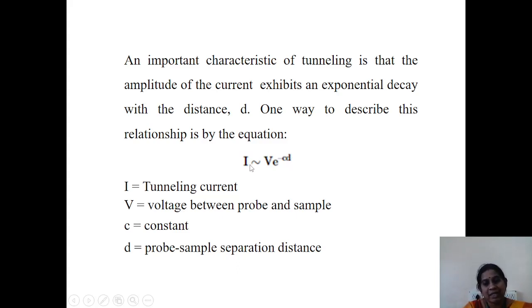So the tunneling current depends on the voltage between the probe and the sample, and the distance between the probe and the sample.